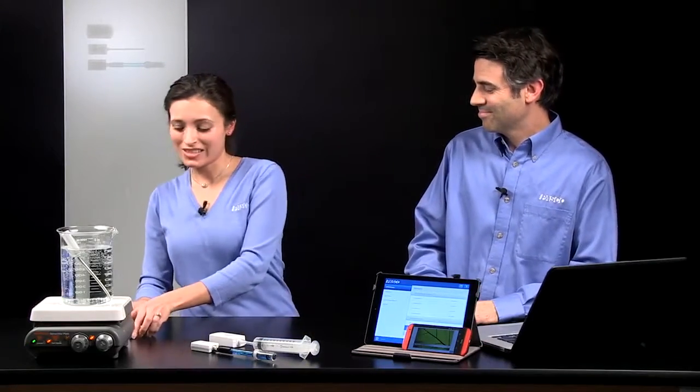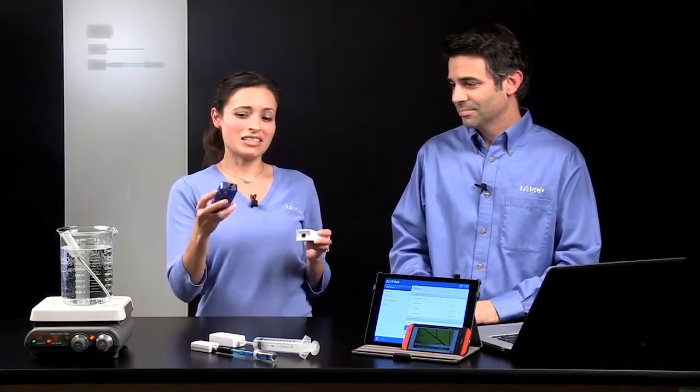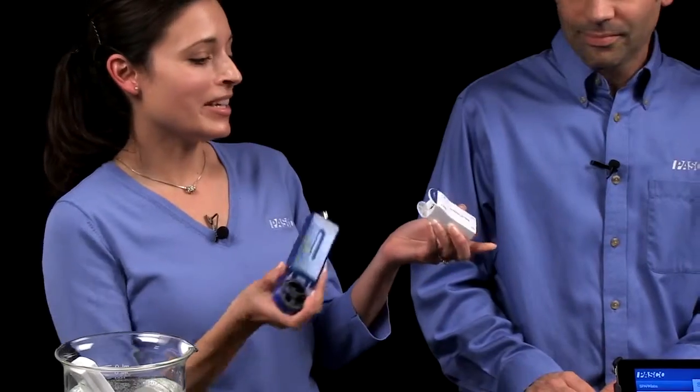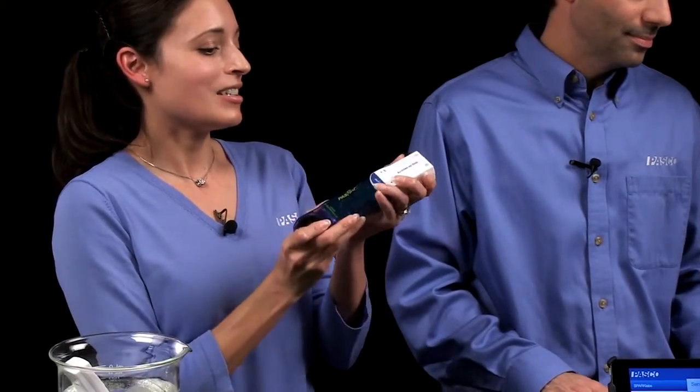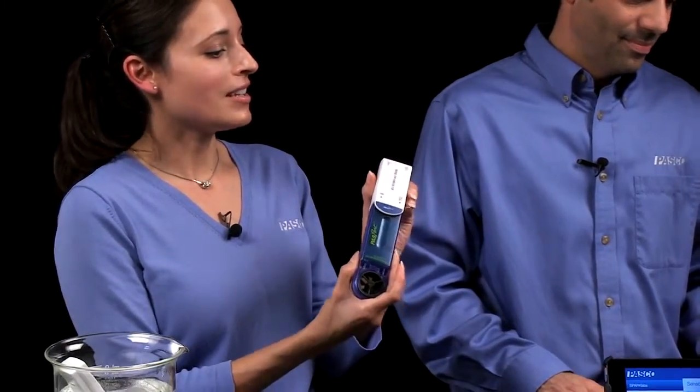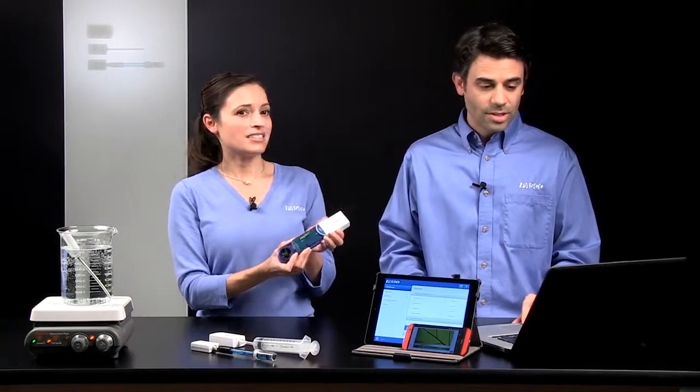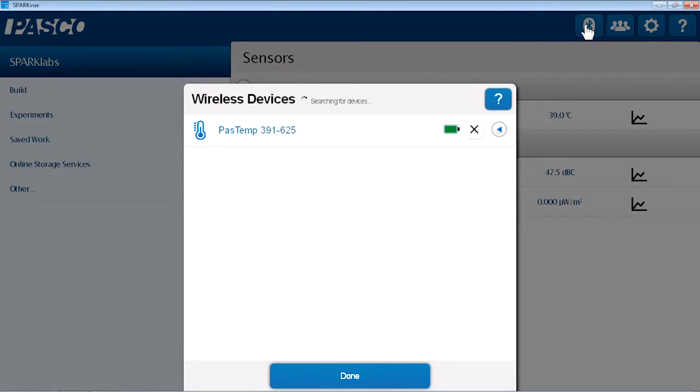And for your sensors that you already have, you can connect an existing passport sensor to an Air Link and make it a wireless connection. Let me turn on the Air Link. And once that's on, just like I did before, I'll connect via that Bluetooth icon. And now I see the Air Link in my device list.